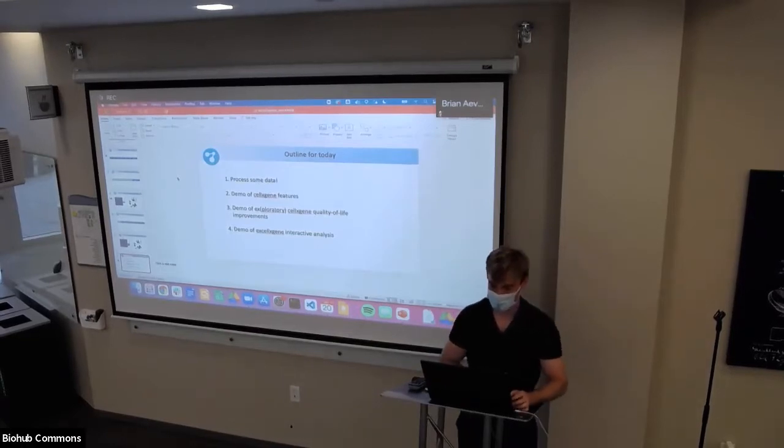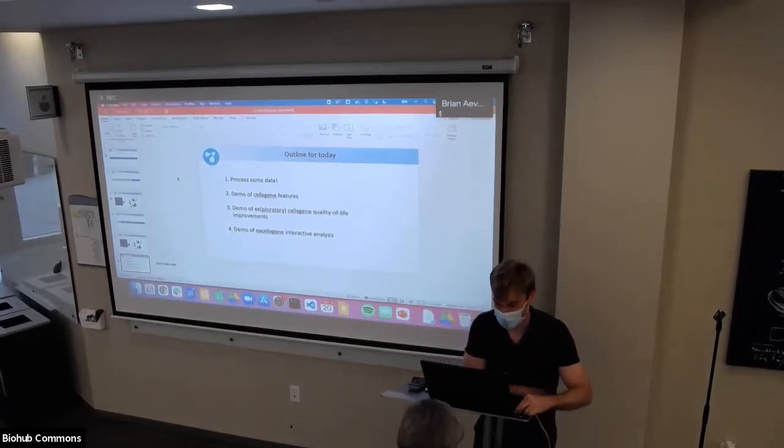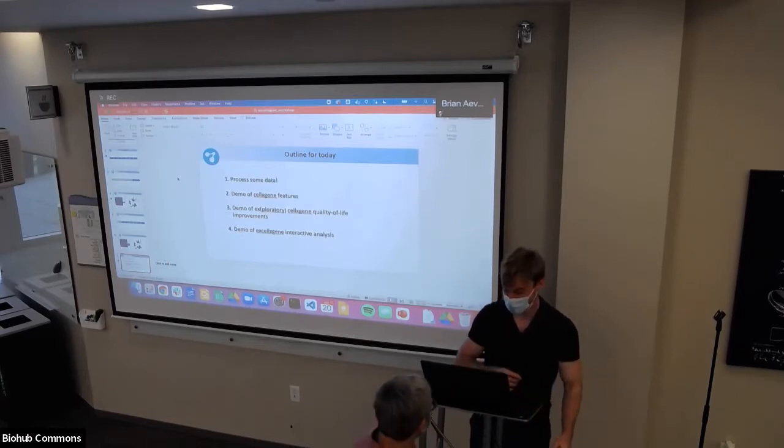Heuristic greedy optimization algorithm. Awesome. I wrote that down.